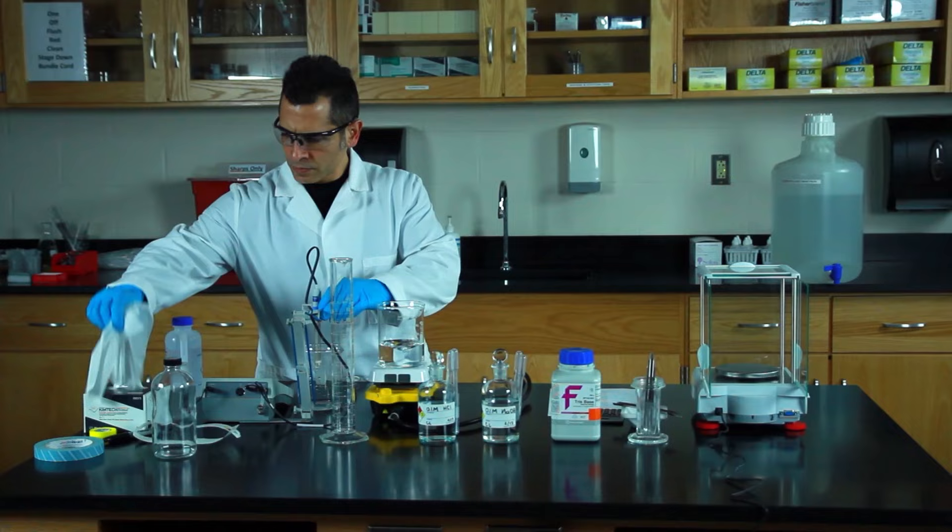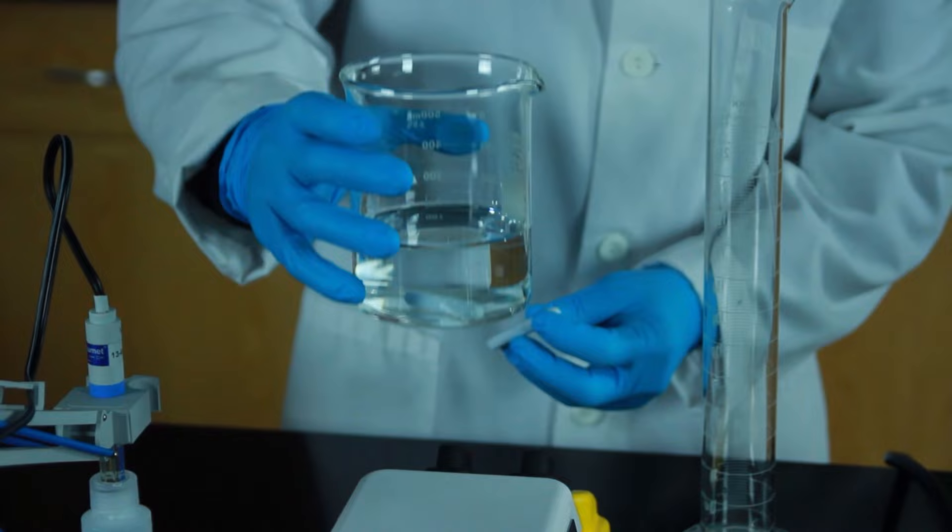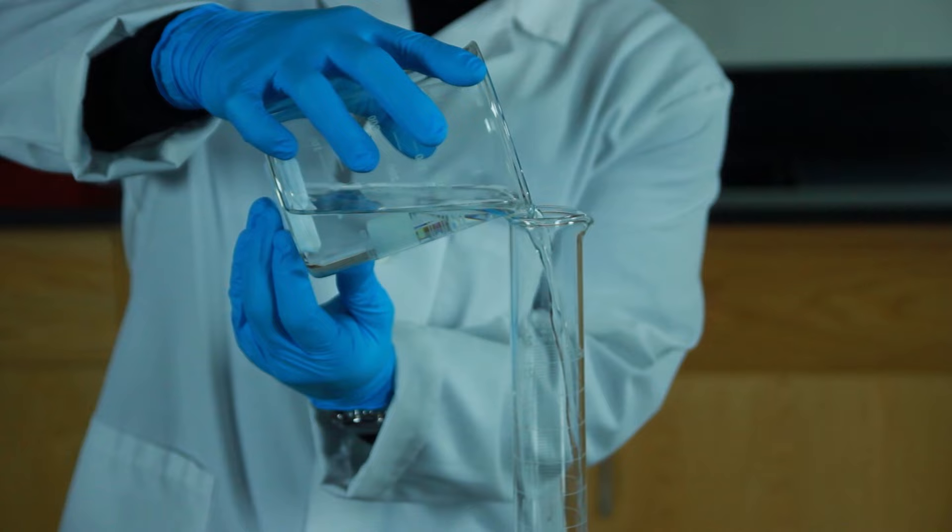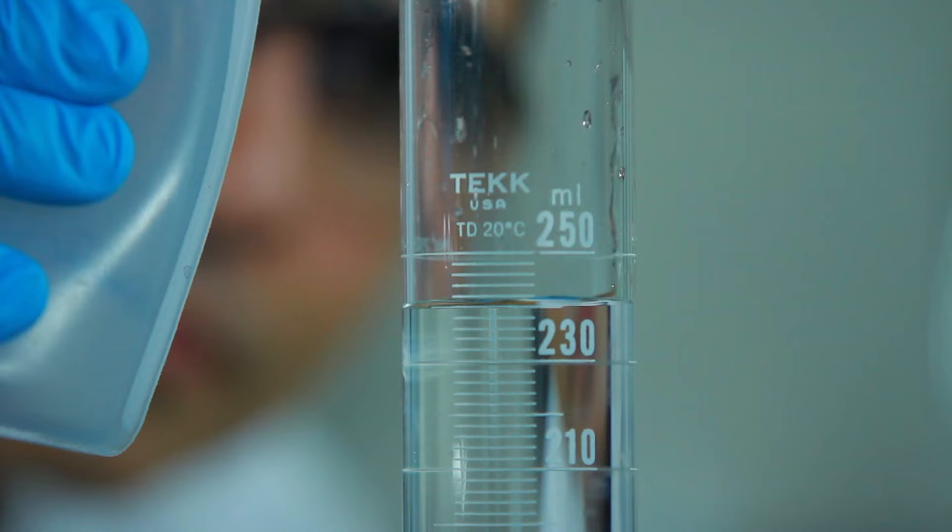Next we need to bring the Tris to the final volume of 250 milliliters. Use a second magnet under the beaker to hold the stir bar in place and slowly pour the buffer into the graduated cylinder. Add distilled water and look at the meniscus to bring the final volume to 250 milliliters.